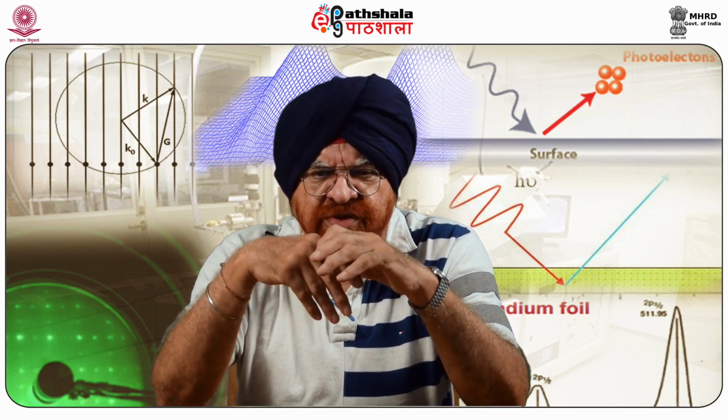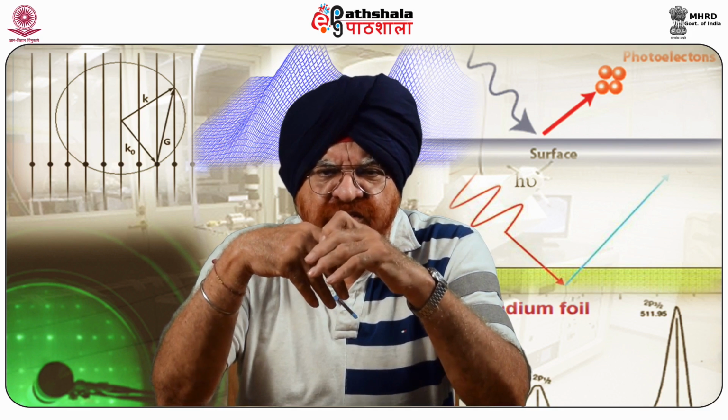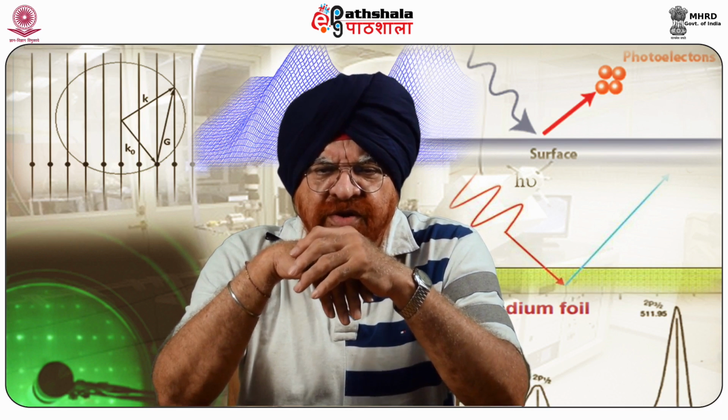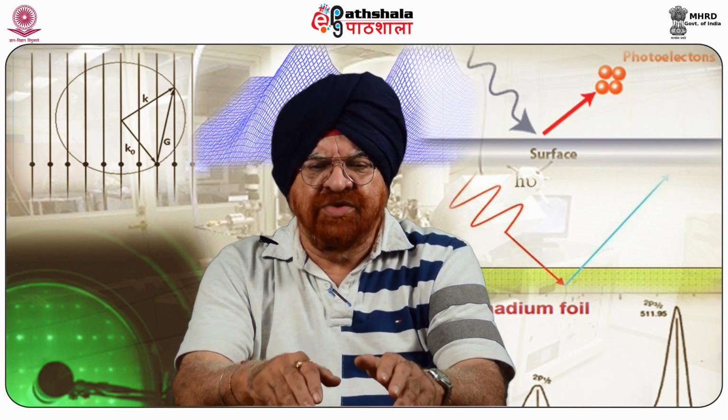The local bonding environment of a species in question is determined by its formal oxidation state, the identity of its nearest neighbor atoms, its bonding hybridization to those nearest neighbor atoms, and in some cases the bonding hybridization between the atoms in question and the next nearest neighbor atoms.